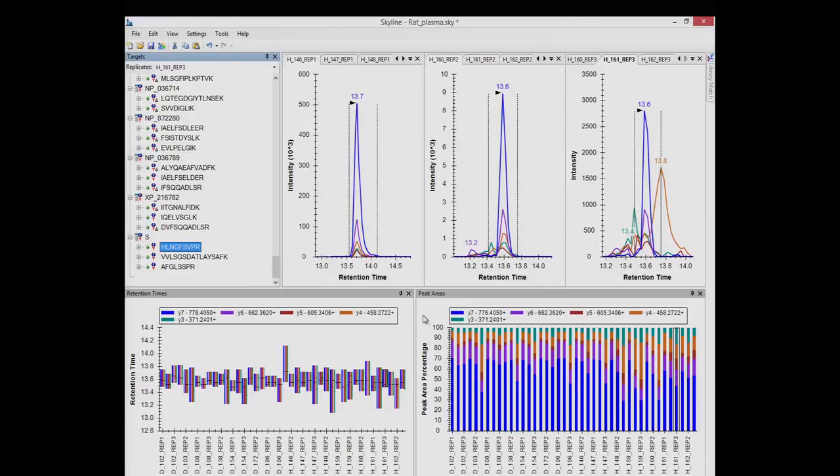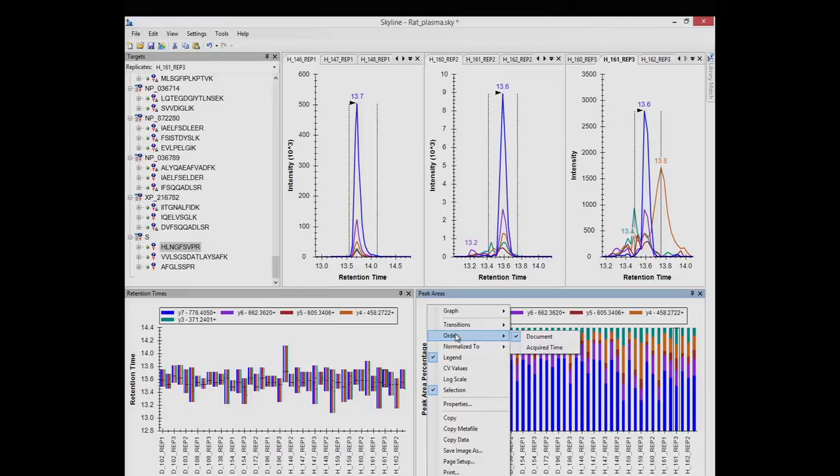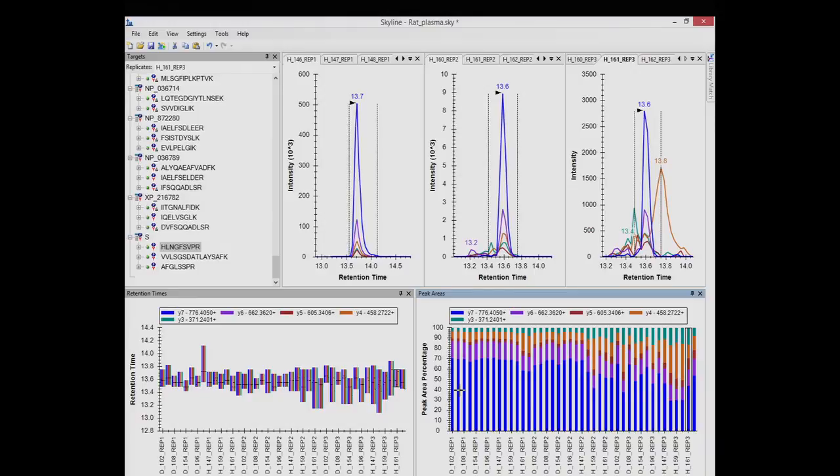Pretty strange stuff. I'm going to say that it might look better again if we order by acquired time. So let's right click and order by acquired time. And now we can see more of a pattern, right? Before it looked kind of random and strange. It still looks pretty strange, but okay. If you look at a lot of these, you'll actually just go, oh, I know what that is. Does anybody know what that is? There's maybe degradation, but yeah.